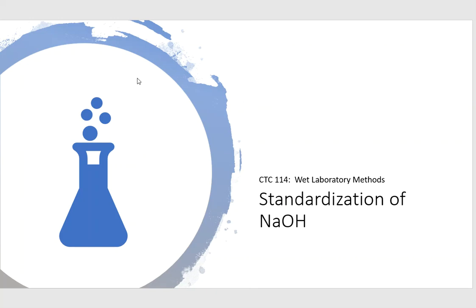Okay, ladies and gentlemen, we are off to the races with titration. Titration, titration, titration. That is what we're going to be doing for the next handful of weeks. You're going to be so sick of titrations by the time this round is over. But folks, this is wet laboratory technique, and wet laboratory technique heavily involves titrations.